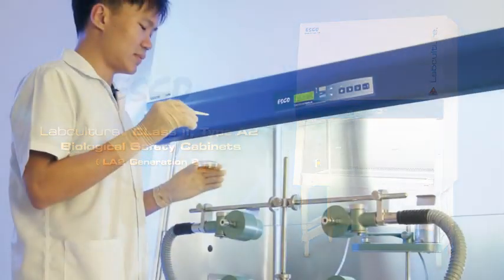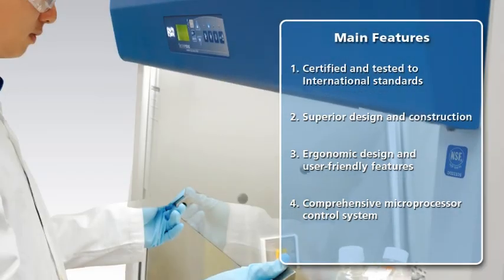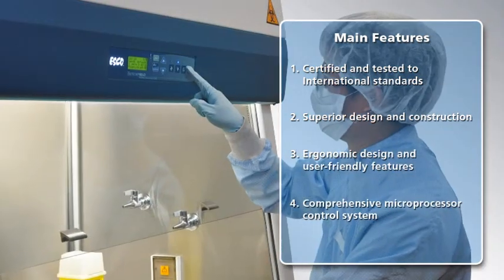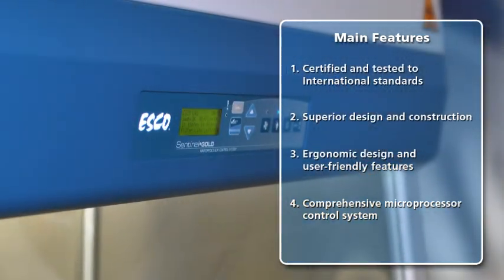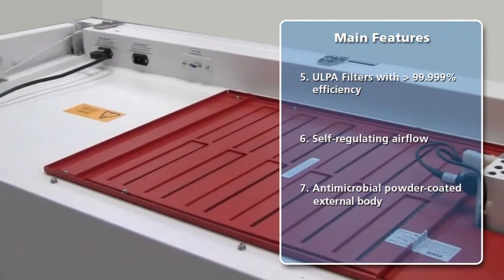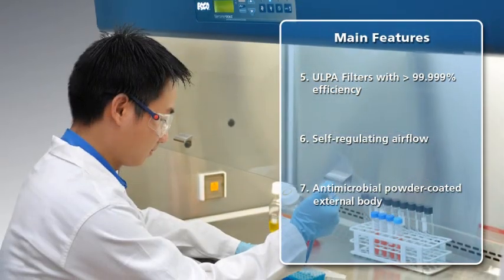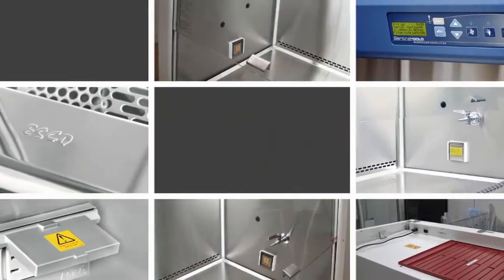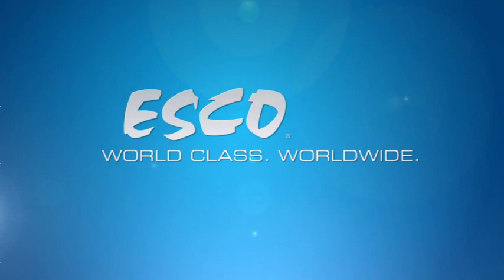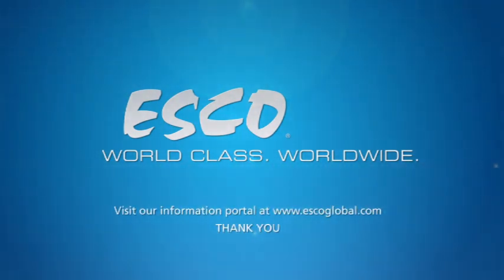The LabCulture Class II Type A2 Biosafety Cabinet is certified and tested by independent test bodies to major international standards for Class II biosafety cabinets. The cabinet offers numerous user-friendly features such as the sloped front design and enhanced cleanability. The microprocessor-based control system provides the user with full monitoring and control of the cabinet's performance. Superior ULPA filters provide ISO Class III air cleanliness within the work zone, ensuring the highest product and operator protection as well as environmental protection. These and many other features make the LabCulture Biosafety Cabinet an optimum solution for the biosafety requirements of your processes and applications. For more information and education, please visit our website at www.escoglobal.com.